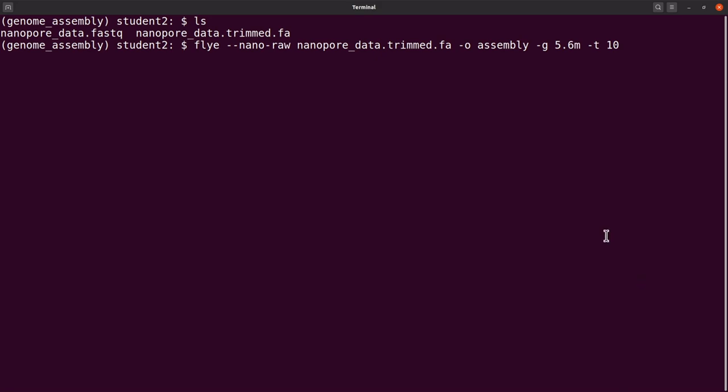Let's say 10 threads. The other option we are going to add is polishing. We want to include polishing. By default, Flye does one iteration polishing, so we are going to increase it. I think the maximum the last time I tried was 10 or so, but let's use -i 2. We are making it two so that you can quickly get your assembly done, but later on you can experiment with the numbers and see how it improves your assembly quality.